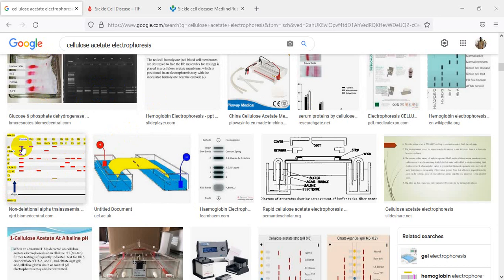So those molecules which are of heavy weight will move last. This is the control band, or the ladder, the molecular ladder. So molecules which are of heavy weight will lag behind. Lighter weight molecules will move faster. So you can see them moving faster. This one is lighter than this, this is lighter than this, and this is lighter than this. So that's how it's displayed.